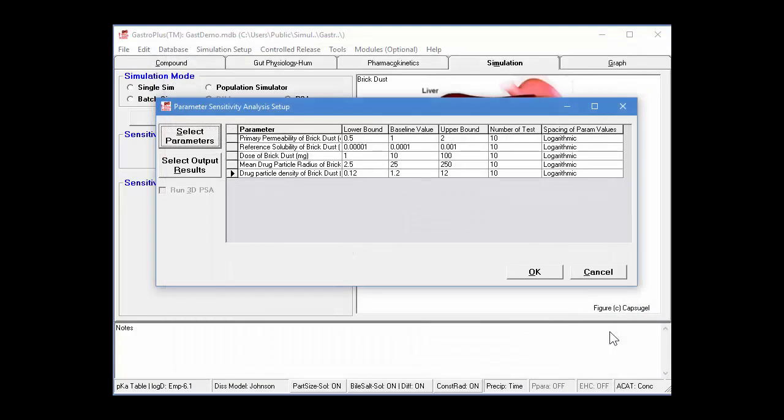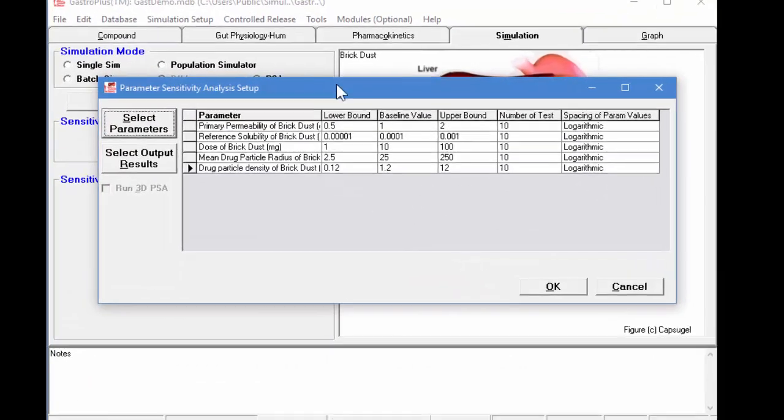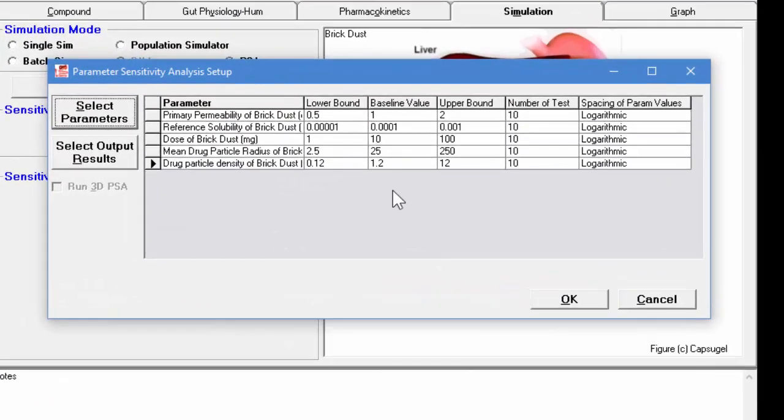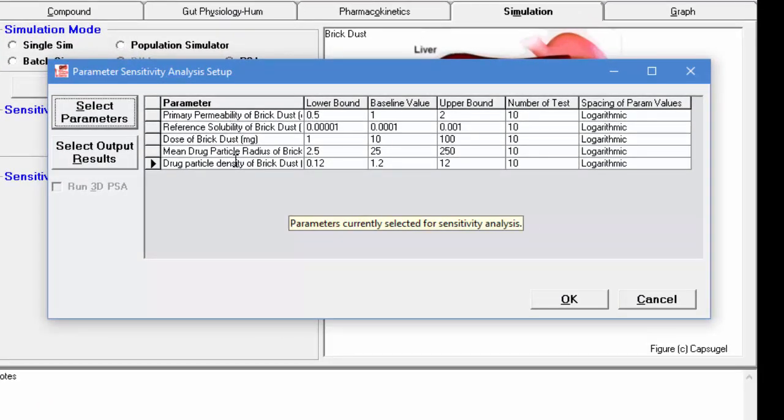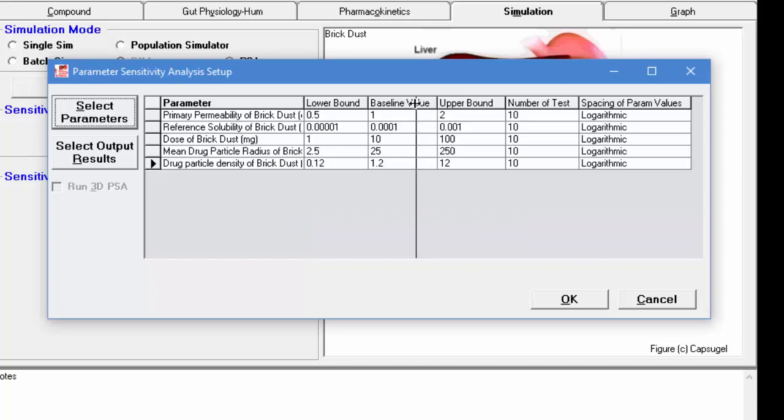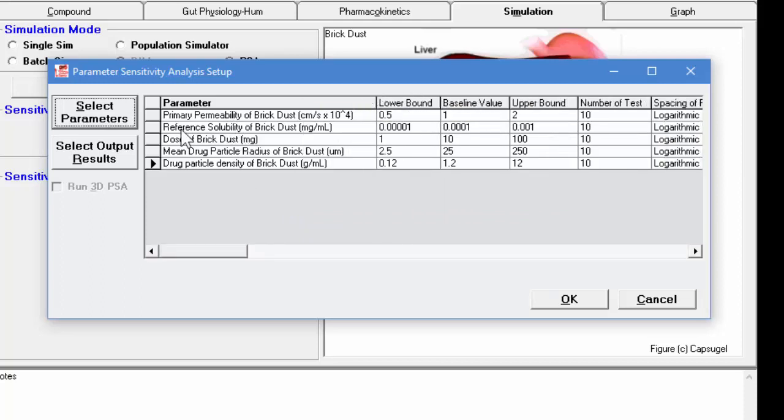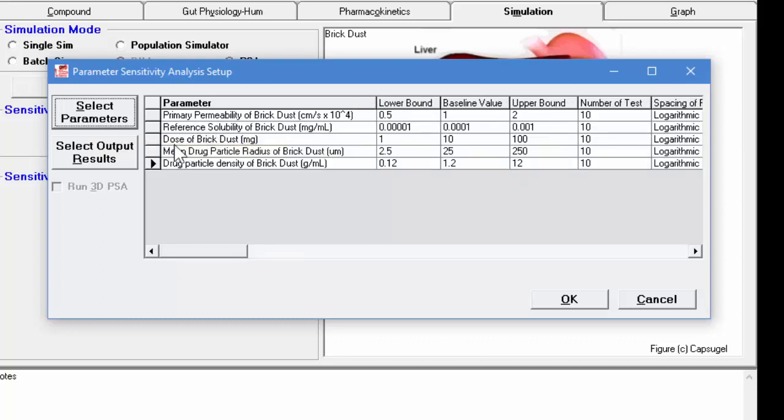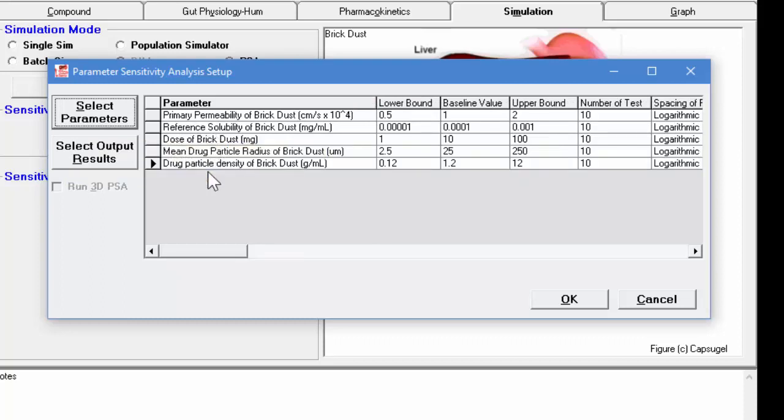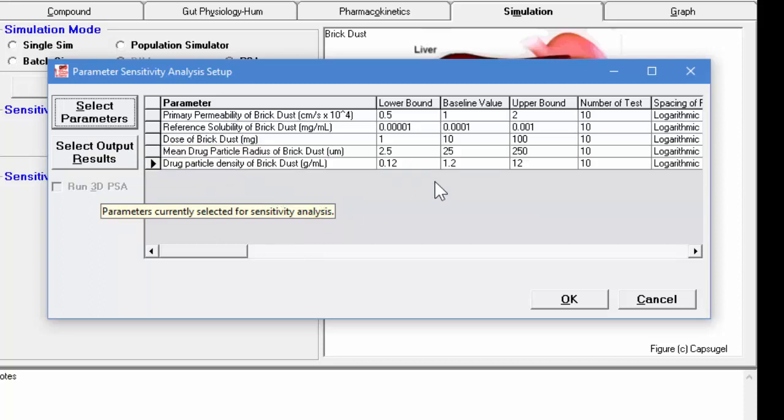So now we click close to close that dialog box. And when we come back to this dialog box, we have the five parameters, which we selected there. We can move this line over to see all of them. So we have the permeability, the solubility, the dose, the particle radius, and the particle density. And then here is the baseline value.